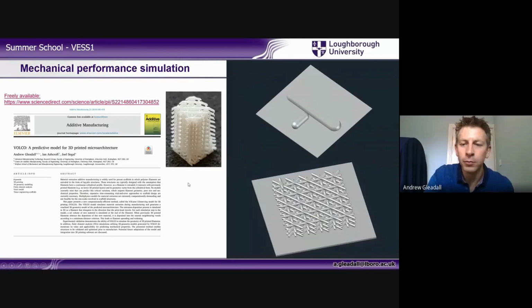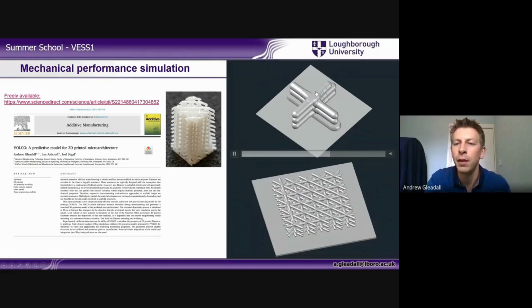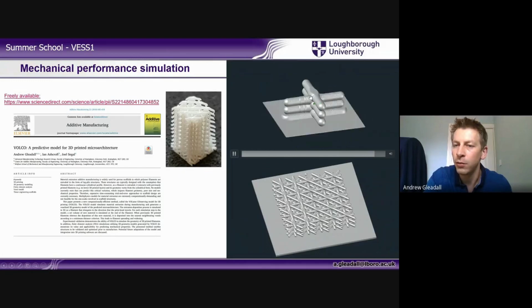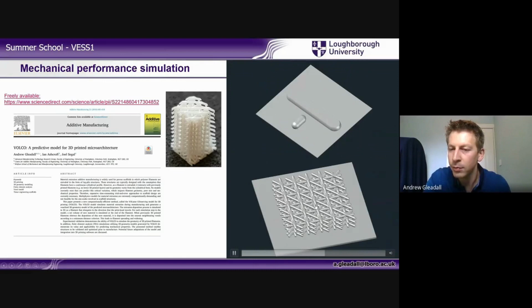So then a final little point is the potential to simulate these mechanical properties. This is showing a video animation of a recent simulation method we developed, which is taking a print path and simulating the polymer extrusion. And at a crossover point, you can see slight bulging, and you can see it here on a larger scaffold.